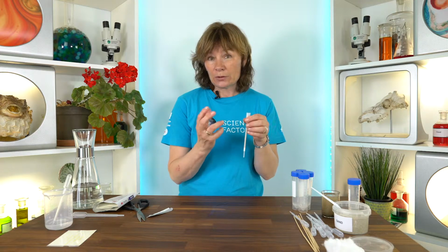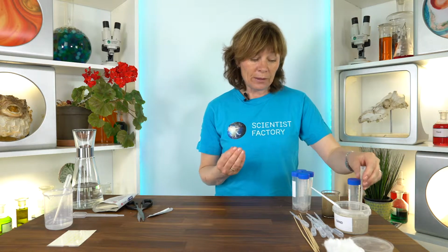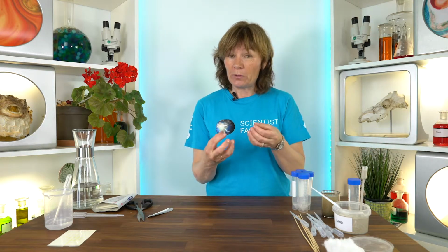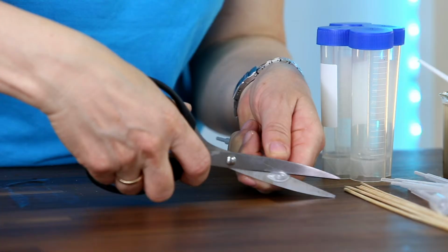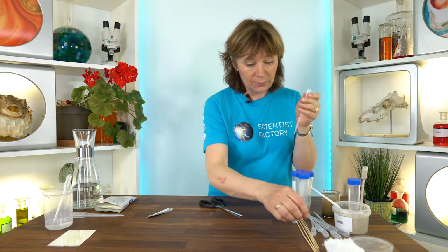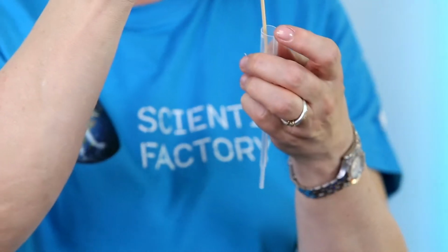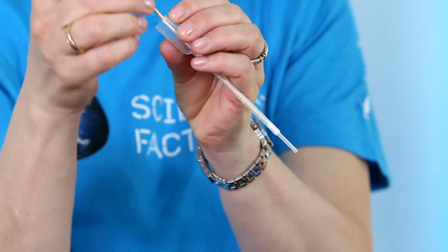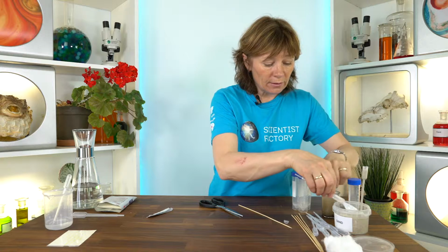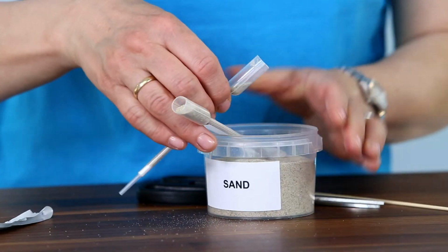So what you need now is to show your students step by step how to put up a basic column, and then maybe they want to develop this column further. Maybe they will try different materials in the column or do something else. But what you do is that you cut the top of the pipette like this. You take a small piece of cotton and you put that in the bottom with this stick here, and then you just add some sand to the column.